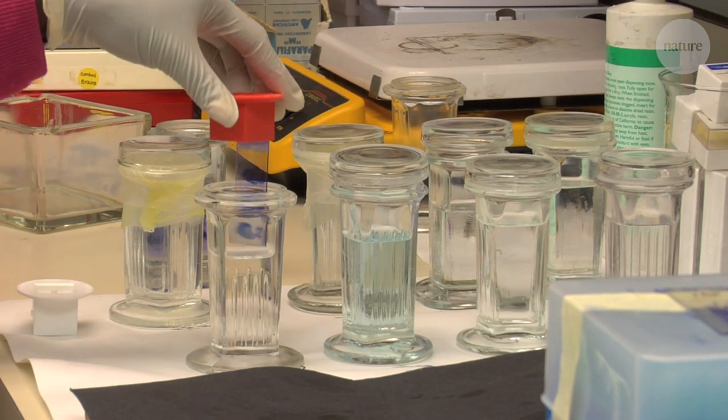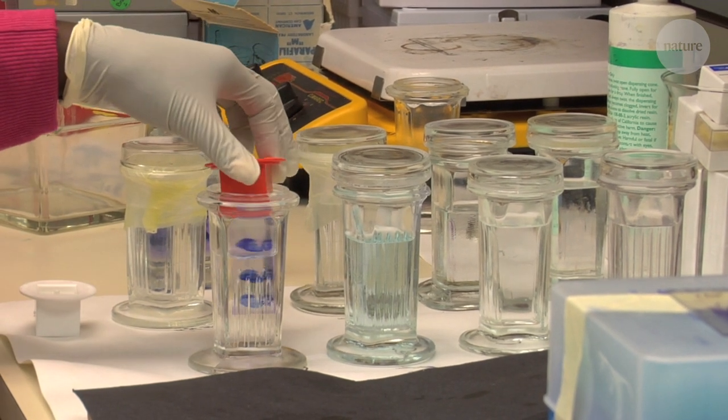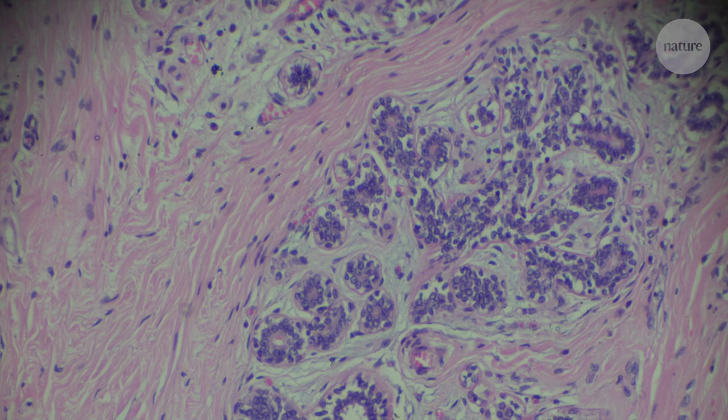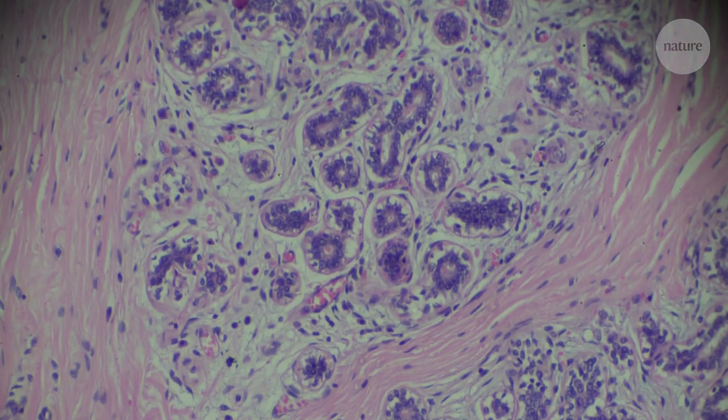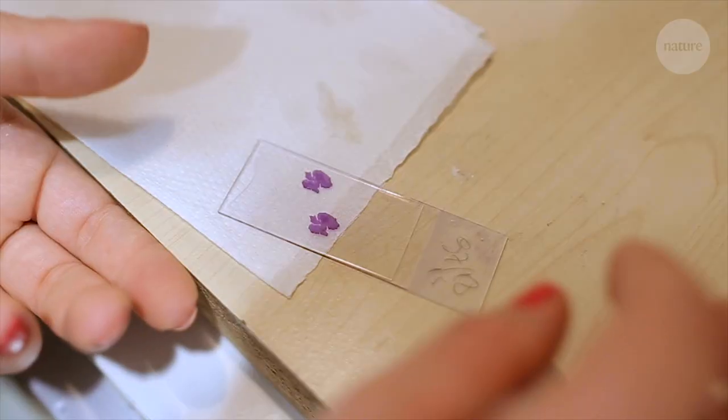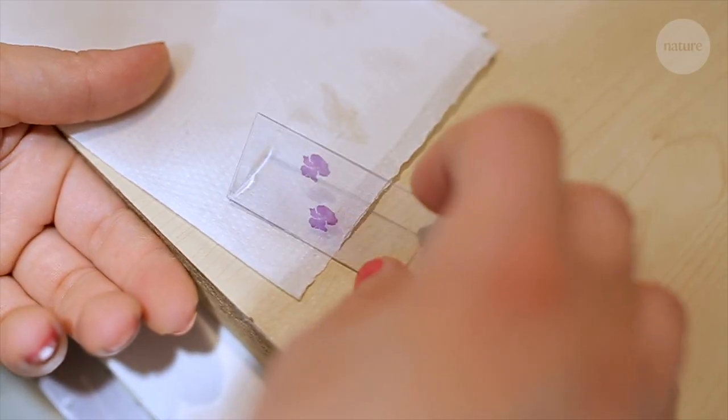You may remember staining slides in biology class, dipping them in red and purple dyes to reveal microscopic structures. Pathologists use similar techniques to diagnose diseases like cancer.